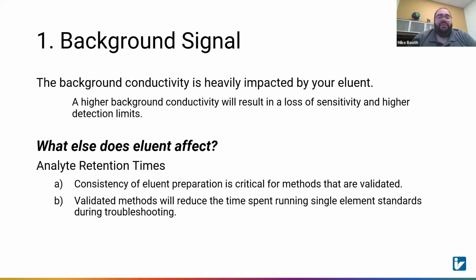The eluent also impacts your analyte retention time. A couple of slides ago, we gave a rundown of how the IC system works and how the flow works through the system. The eluent is going to play a major role in your retention times. Since your methods are validated, you want to make sure that everything is consistent. So how you prep your eluent is a big factor.